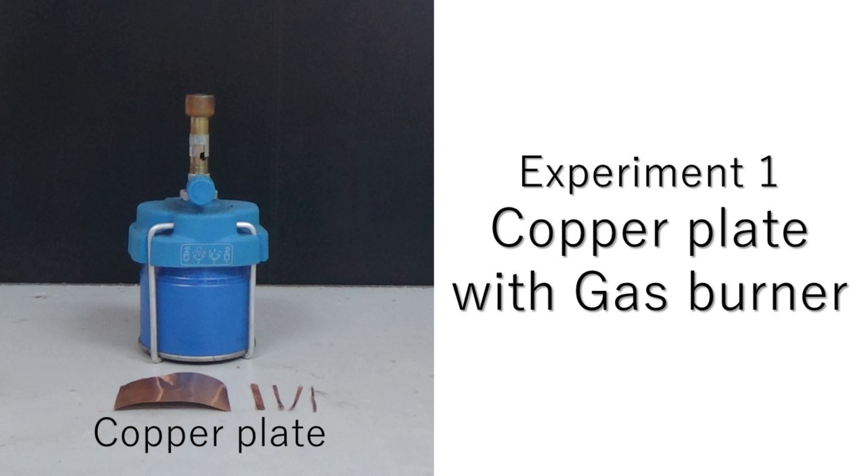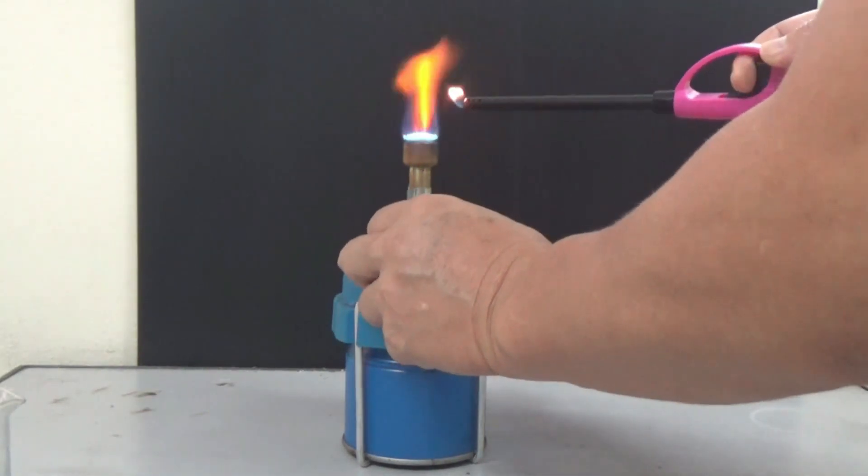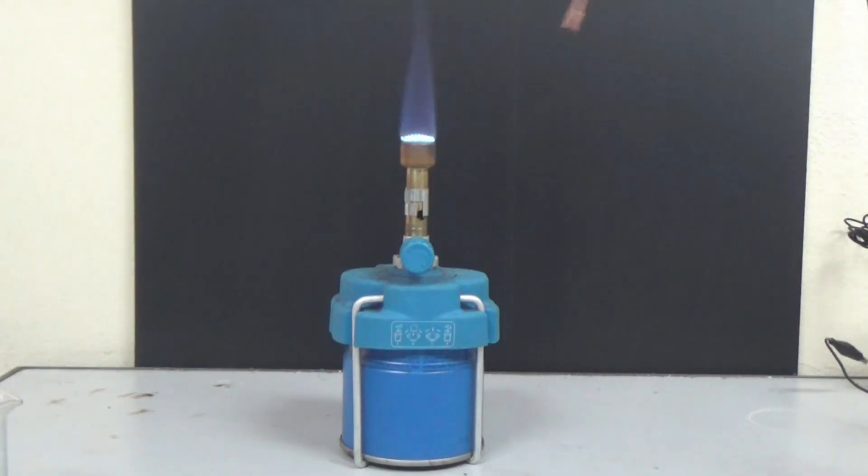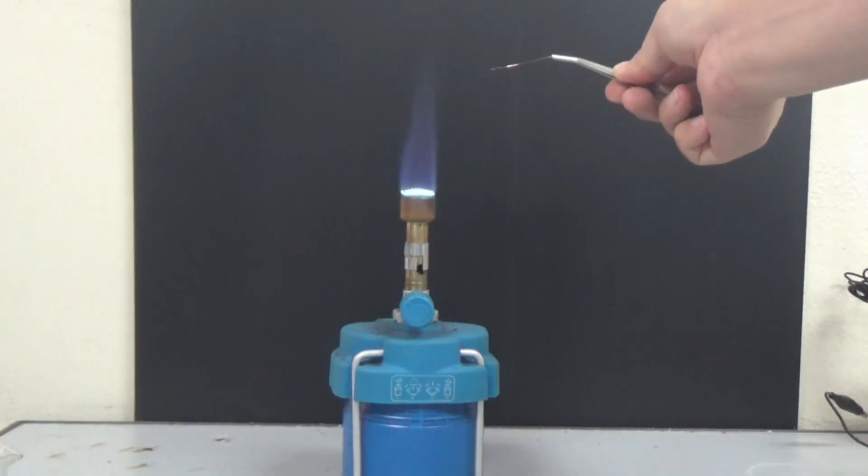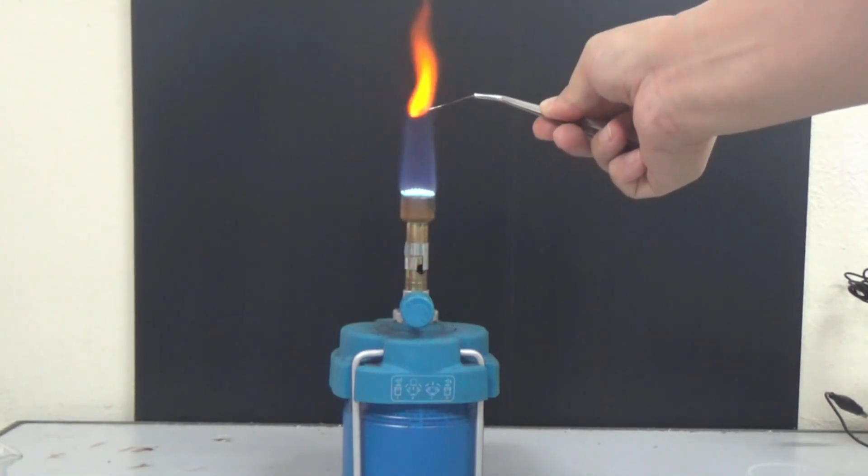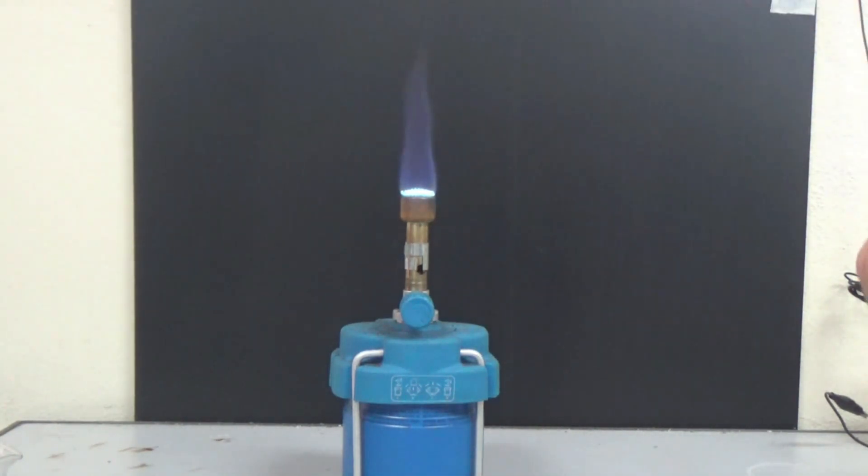First experiment: Put the thinly cut copper plate into the flame of a gas burner and observe the flame reaction. A slight green flame reaction can be observed.